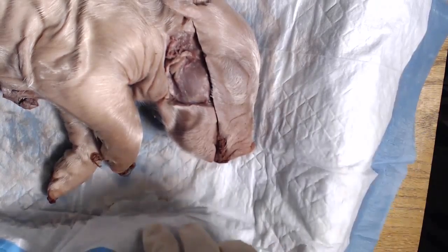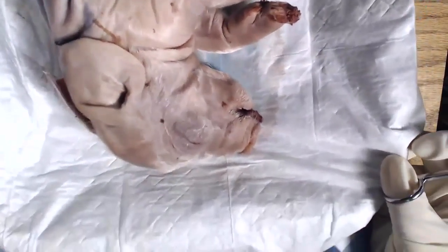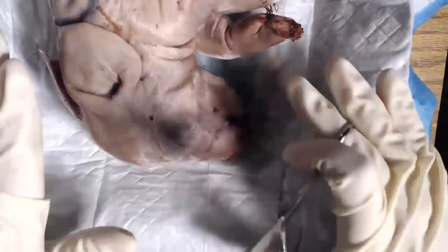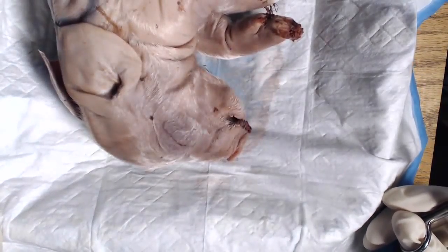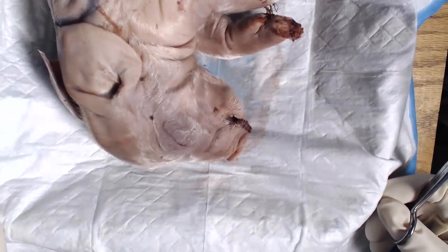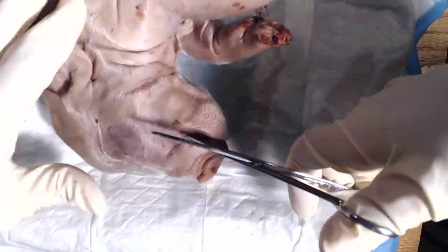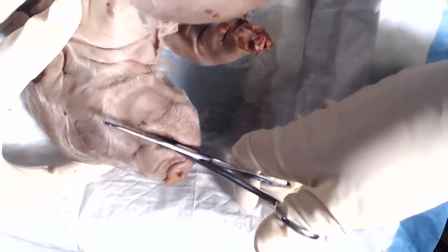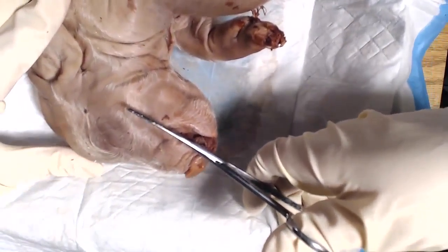All right, so I'm going to go ahead and flip my pig over. I'm going to turn it a little bit, just so I can see the other side of its face and easily cut through the jaw again. I'm going to start, just like last time, at the corner of the mouth, right next to the tongue. Make sure you don't cut the tongue itself, but just put your scissors right on the inside of its cheek.